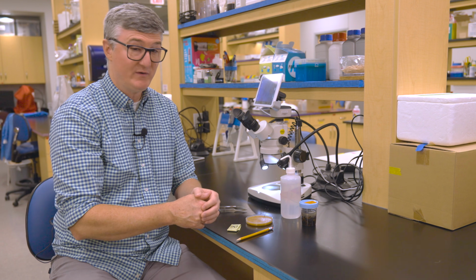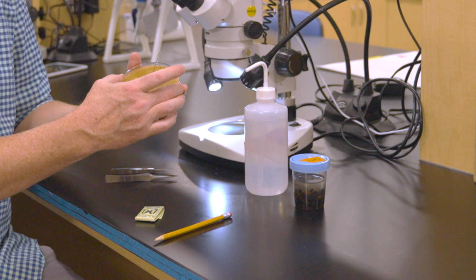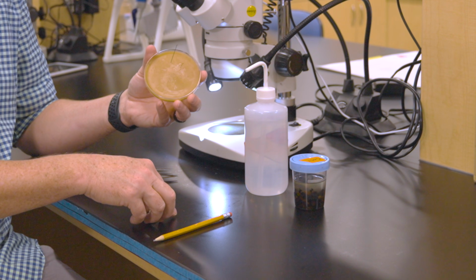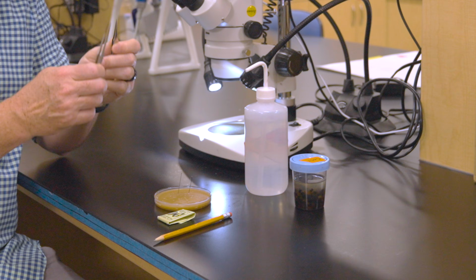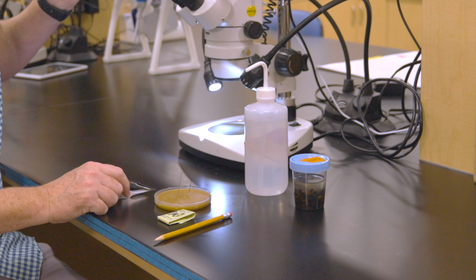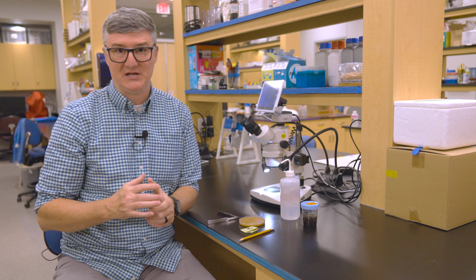So we've got the bees, we've got extra alcohol, we've got a petri dish with beeswax in it, insect pins, spare insect pins, 2 pairs of forceps, a dissecting microscope, and an extra light source. Now let me describe for you the dissection process.